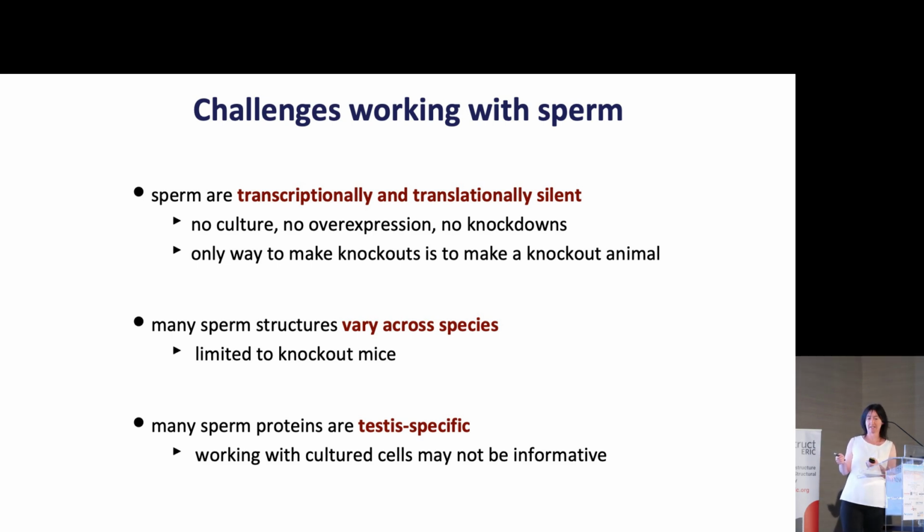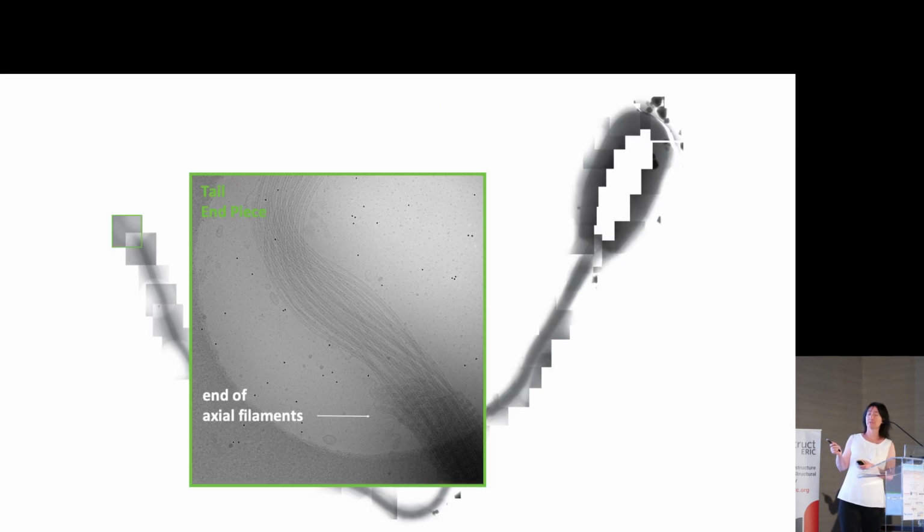And the inspiration actually came from going back to this first image, and now I show you the big version of this end piece here. What you can see in this image is something we tried to avoid and fight against for 3 years: the cell actually lost the plasma membrane around it, so it's not here anymore. For 3 years, when we did all this tomography, we tried hard to find the condition for how to plunge so that we don't lose the plasma membrane, and I showed you that we are able to do it.